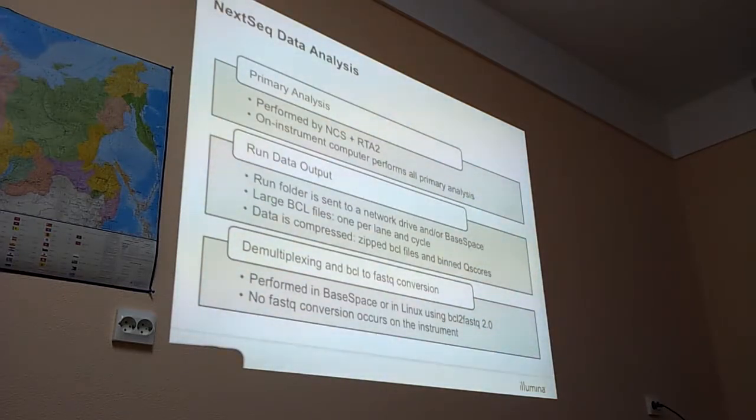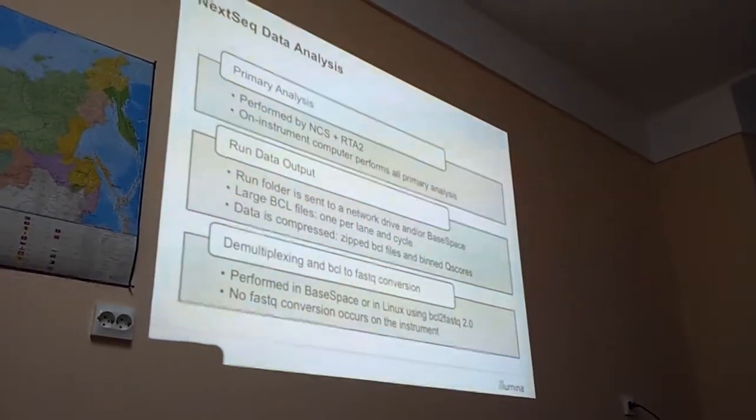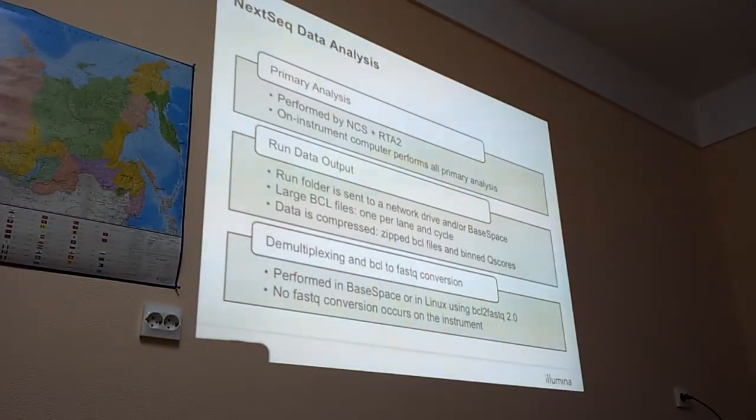In January there will be a program on the server to analyze everything, for the NextSeq. But of course, for example for bacteria, you need other software, and this is at the moment not yet on BaseSpace on-site. It's on BaseSpace cloud, so you can always use BaseSpace cloud. We need to push for all these programs for processing. So, but I would recommend you, if you learn this, to really.